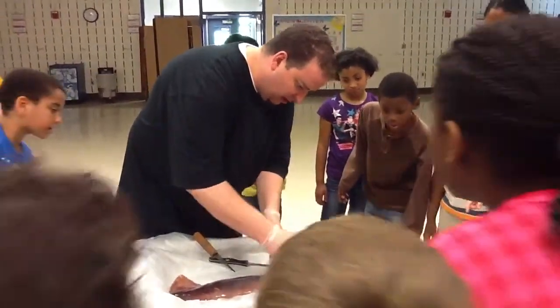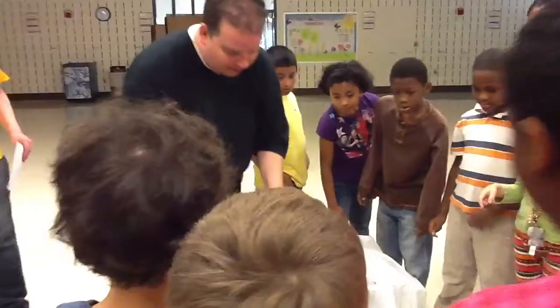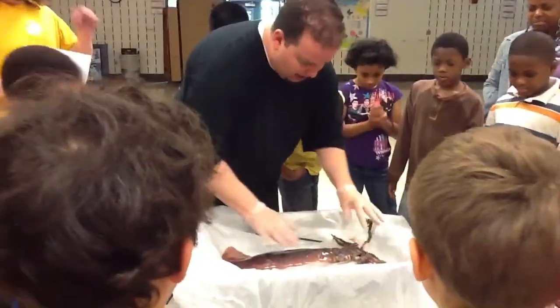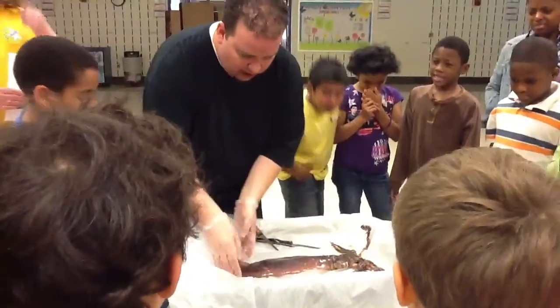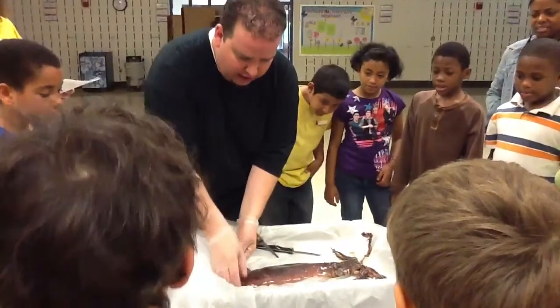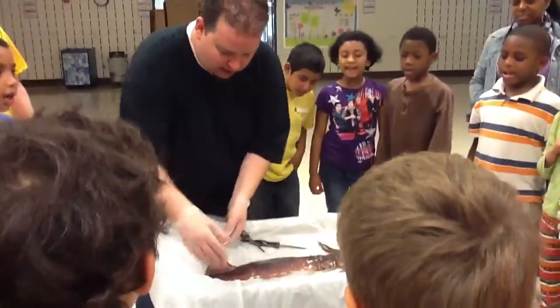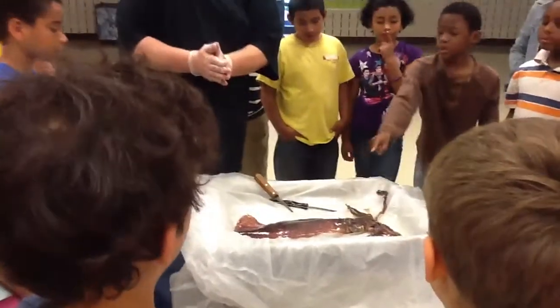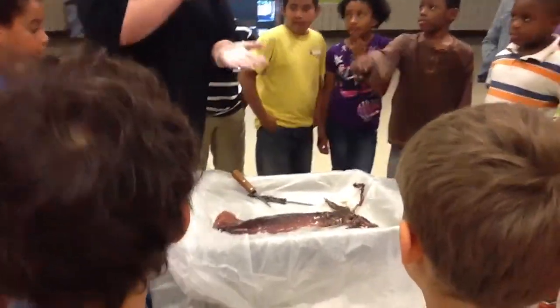Do you see the beak? Wait, wait. I'll see it again. So we have the eyes in here. And then these — what are these things on the side of the mantle? And they're for what? Swimming. They can hover, right? Because we saw them hover in the water.